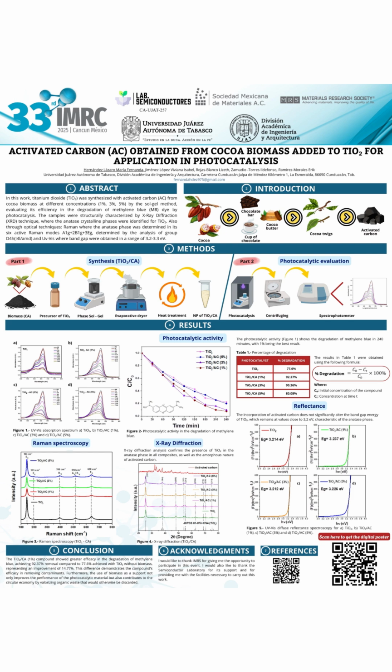Raman and X-ray diffraction were used to check the structure of our synthesis and that it was not affected by carbon, giving us in both cases the anatase phase, which is the known phase of TiO2. Finally, in reflectance we did not obtain much variation in the energy gap, 3.2 eV, characteristic of the anatase phase.